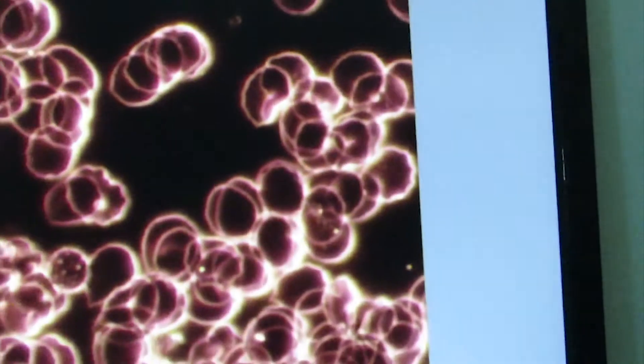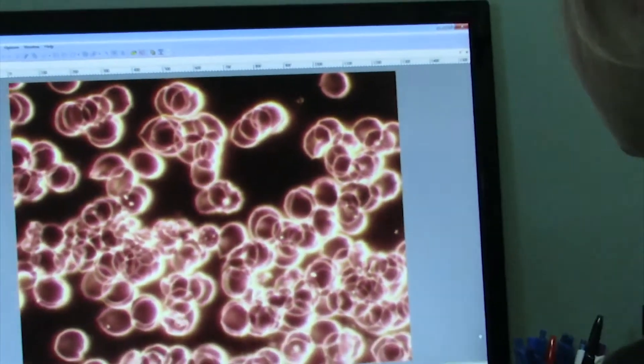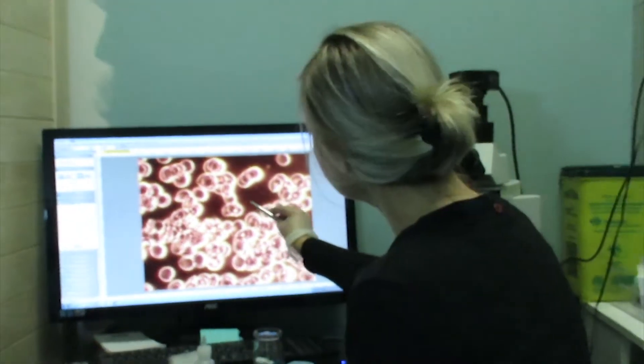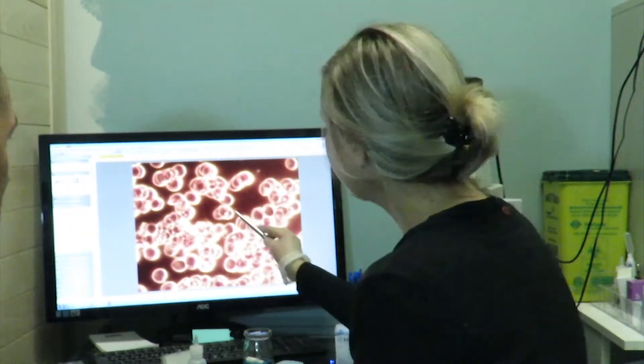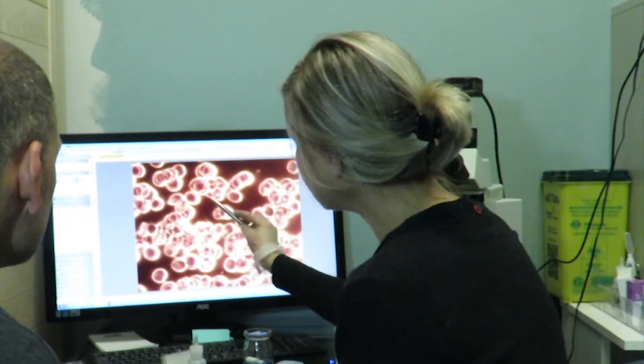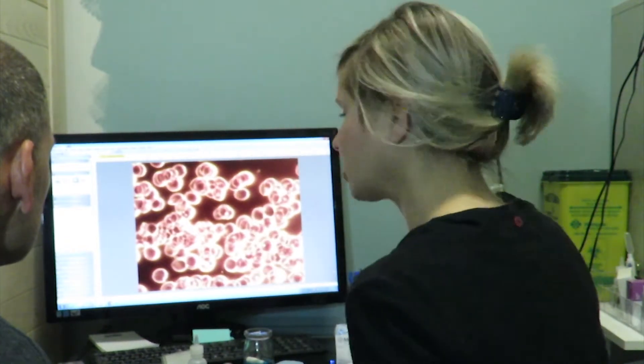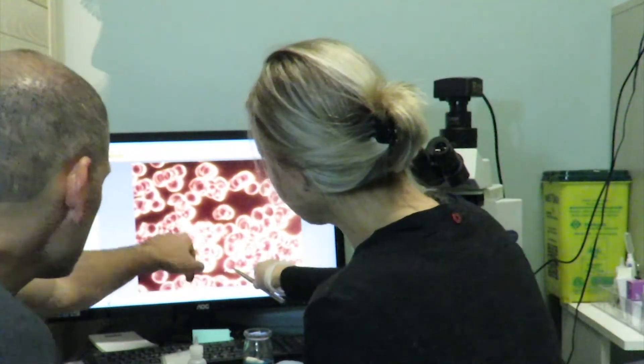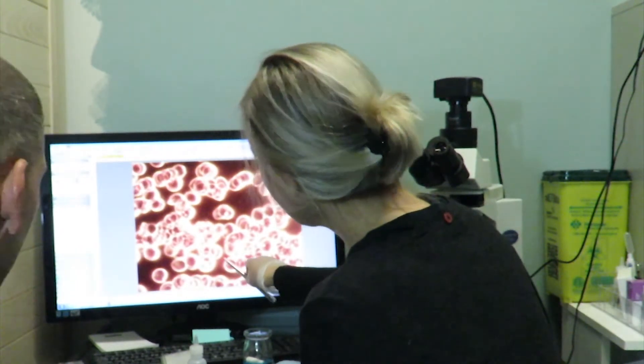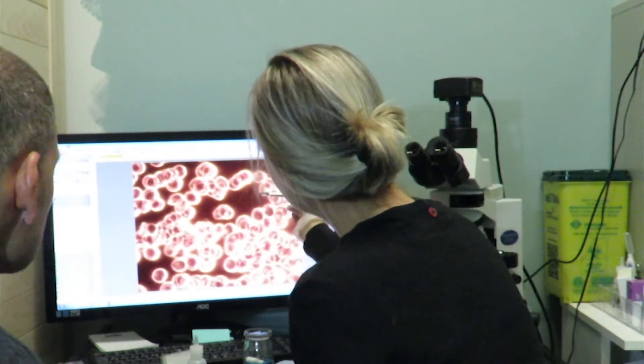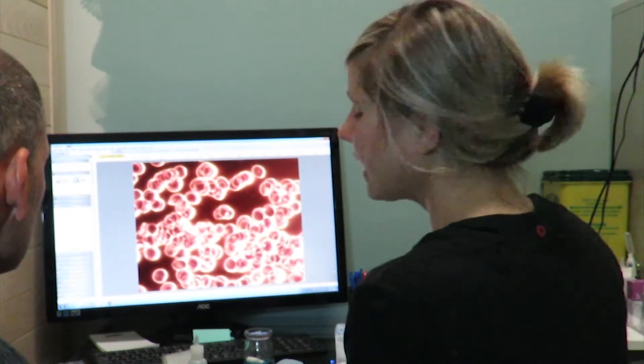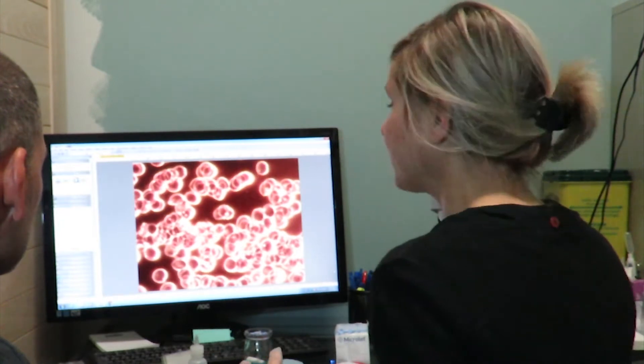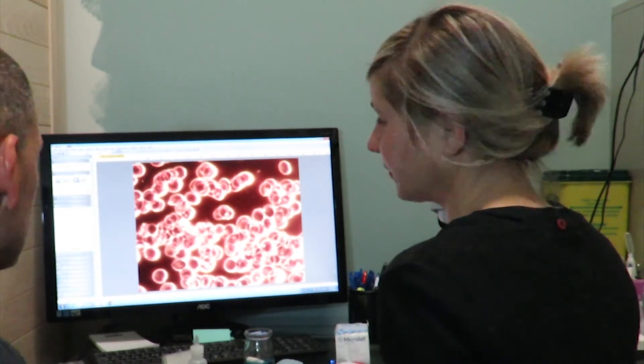Now that we see some black area back here, we're going to raise our light a little bit. We want to see how well the liver is functioning. As you can see back here, I don't know if you remember, but we did have some liver toxins when I first saw you. But this is nice and clean right now. We don't see any of what we call spicules, which are indicators. This here is a little tiny parasite there. See how that's a little bit different from these little tiny snowflake looking? Those are food fragments. It's normal to have a little tiny bit of food breaking down.